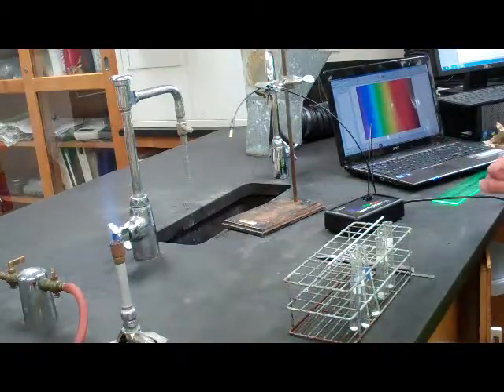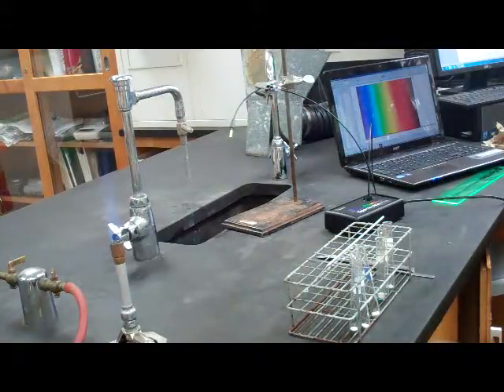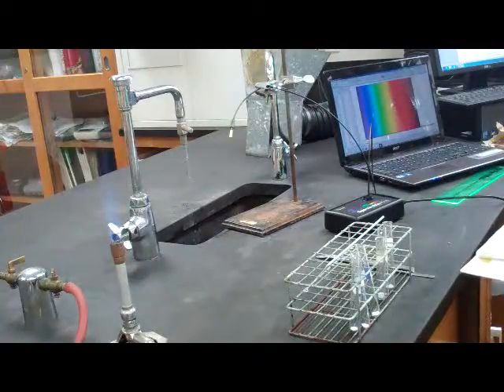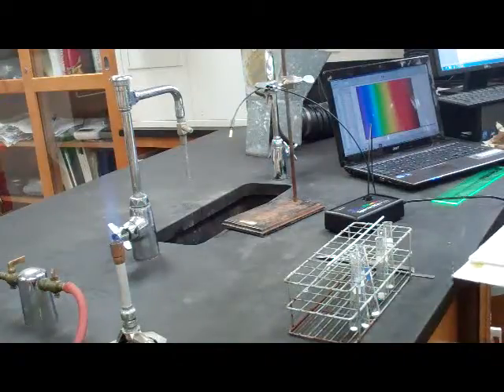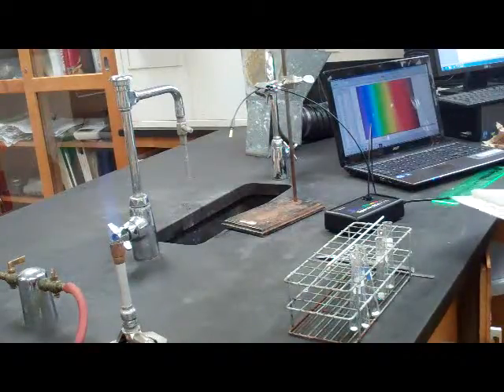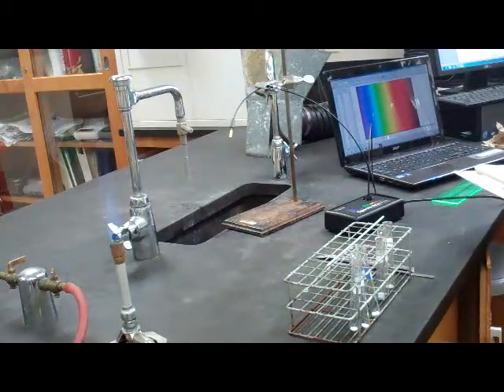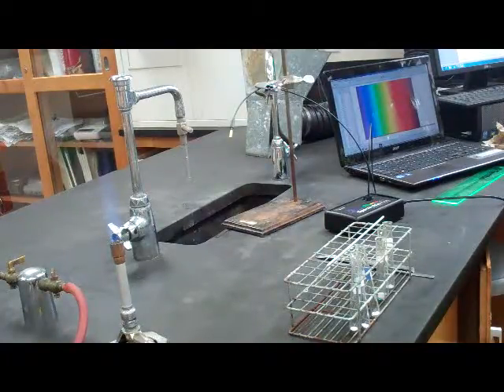So, pushing Collect, and we have our readouts coming in.